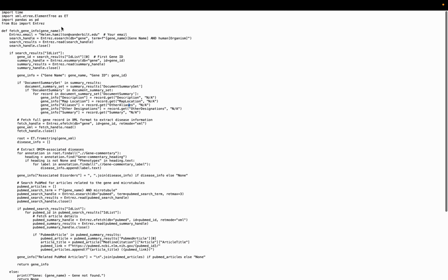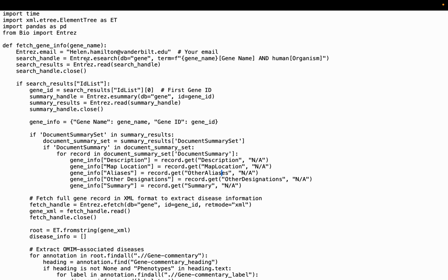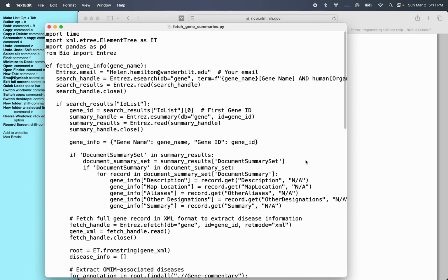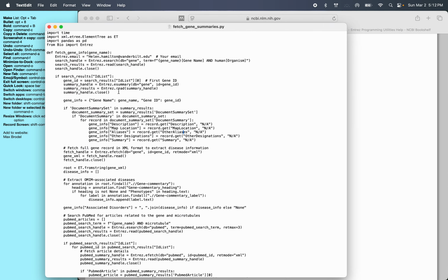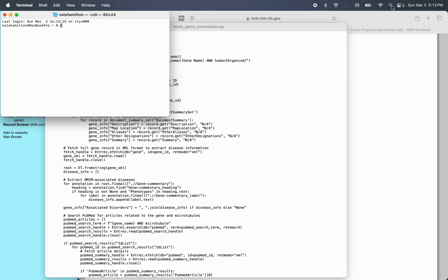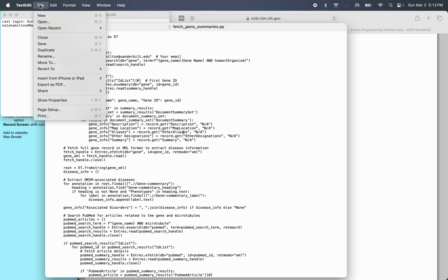We're going to go through this code here. Actually, before we do that, I want to note that to start, you should have your terminal open, and you should also have this text editing software. There's a bunch of different types out there. If you're working with Python, I think the most common one is PyCharm.